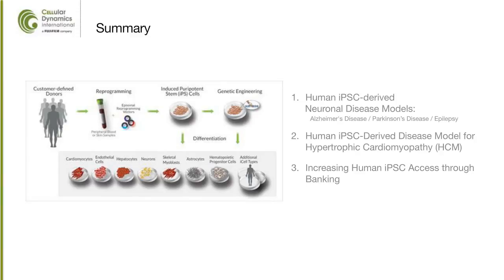Yes, that's a good question. We have looked at other inducers to really induce and bring out that cardiac hypertrophic phenotype. We have looked at isoproterenol as well as phenylephrine, and all of those that we've tested have shown a response. However, the endothelin was the most robust response in our short assay. So some of the other inducers will work. However, the workflow needs to be adapted a little bit.